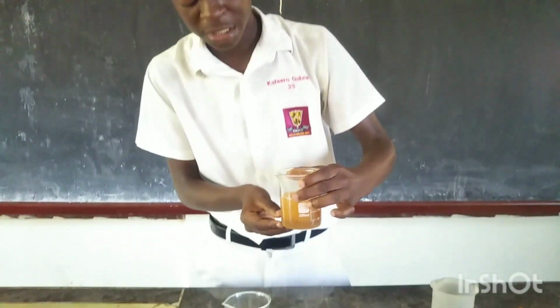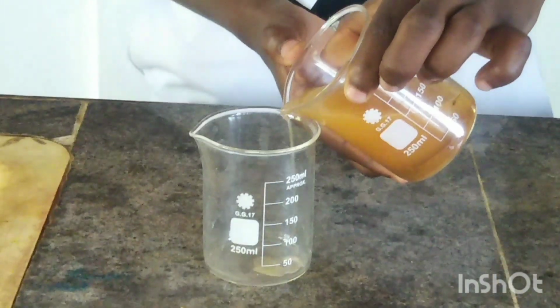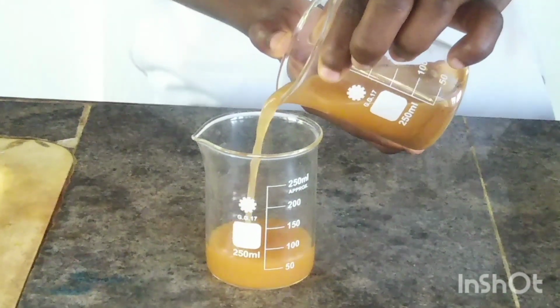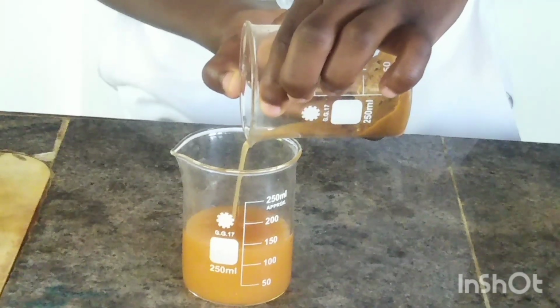So here, as I pour it now, make sure you are so careful that the sand doesn't mix again with the water. So here I pour my water into the empty beaker. Yeah, so you can now see.